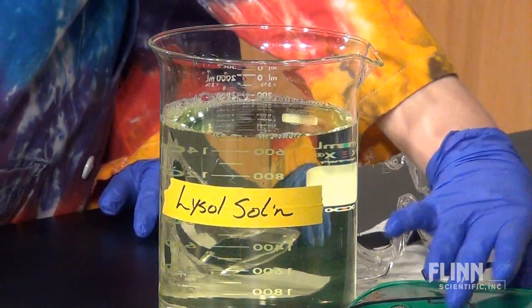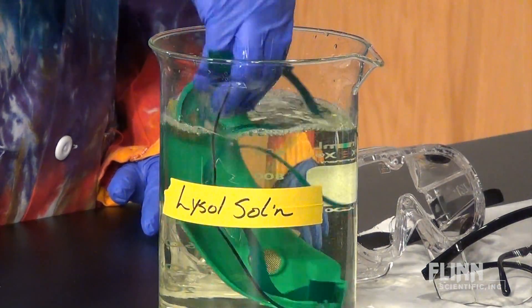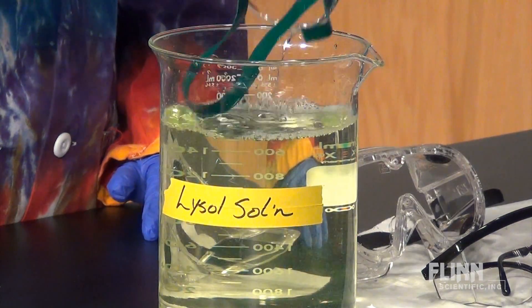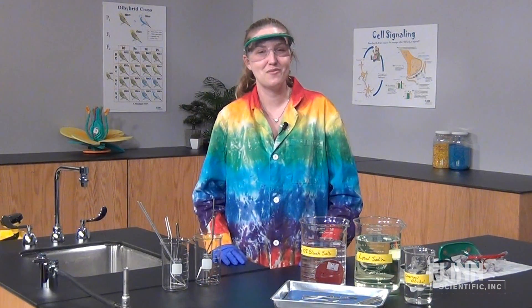The end of the year is also an opportune time to sanitize protective eyewear. This can be accomplished by placing the eyewear in a UV sanitizer, a dilute Lysol solution, or by using lens cleaner.